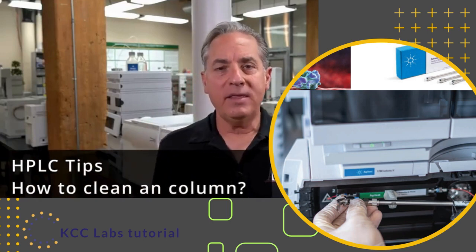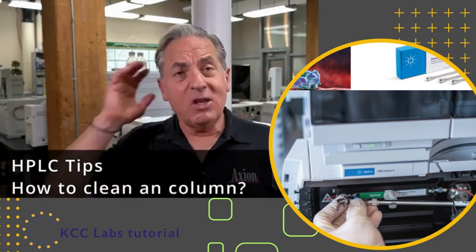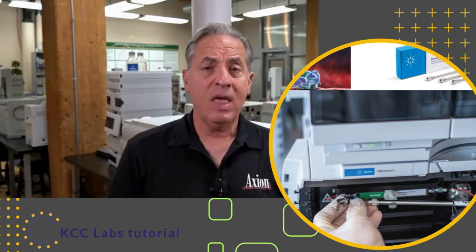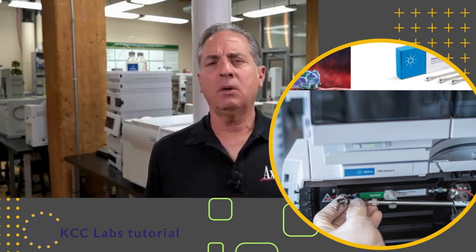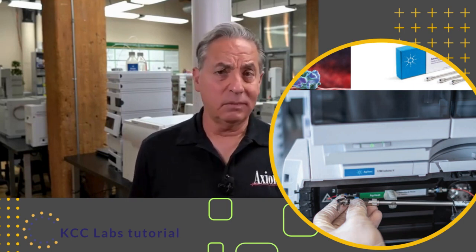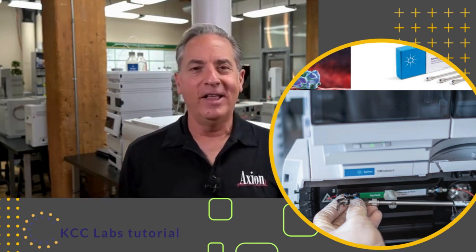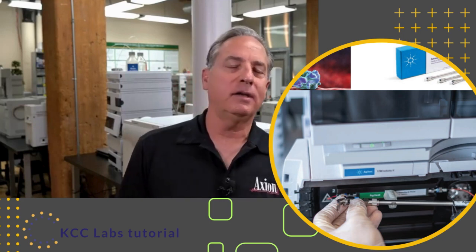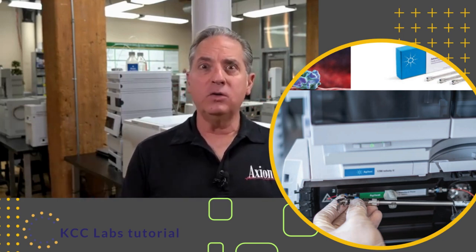Can you clean a column? And the answer is sure. So let's say your column is dirty — let's say you got a reverse phase column, a C18 column. What does it mean to say it's dirty? If you physically damage the column, if you bent it in half, if you ran it at pH 14 overnight and dissolved all the silica, or ran it at pH zero and chopped off all the C18 chains — those are permanent damages. But good news is those kind of things rarely happen.